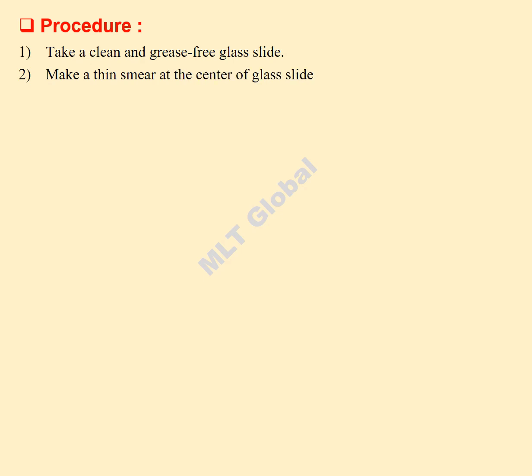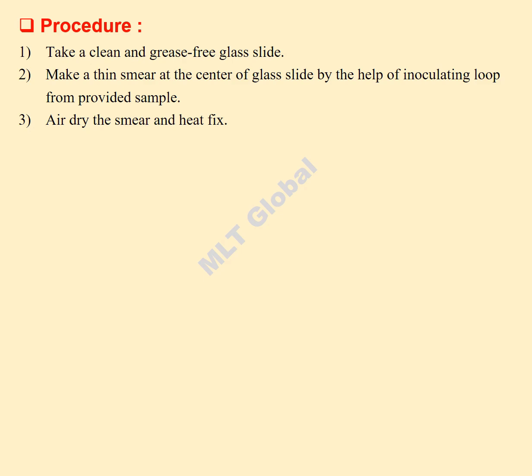Procedure. Take a clean and grease-free glass slide. Make a thin smear at the center of the glass slide with the help of an inoculating loop from the provided sample. Air dry the smear and heat fix.